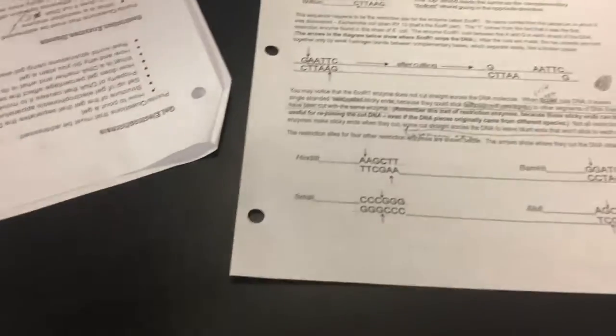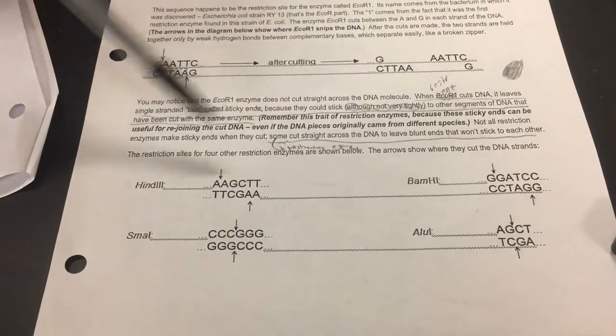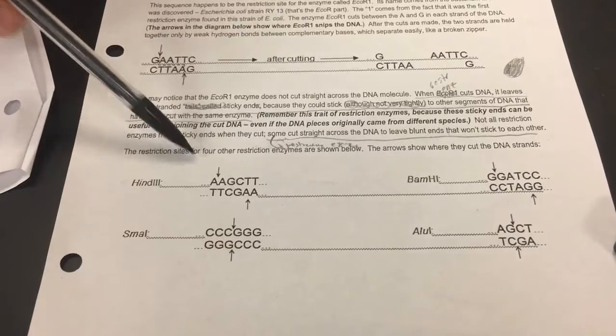So if you look at this paper, if you cut my DNA with HindIII and BamHI, you will get two different DNA sequences because these are two different types of restriction enzymes. Let's say you were to take my DNA and then Derek's DNA, but you cut them both with HindIII, you get two different DNA sequences because there's two different types of DNA.